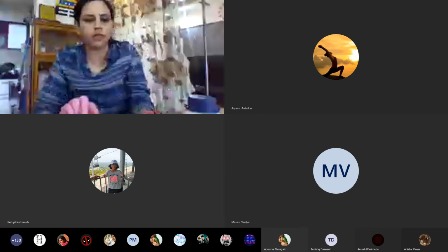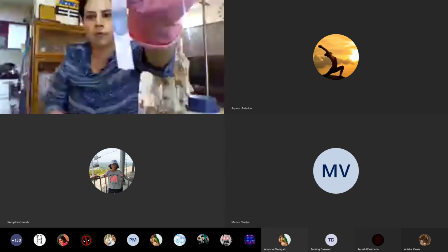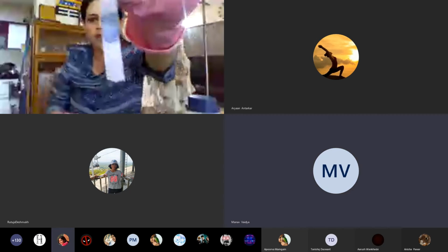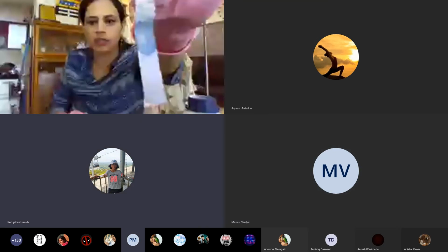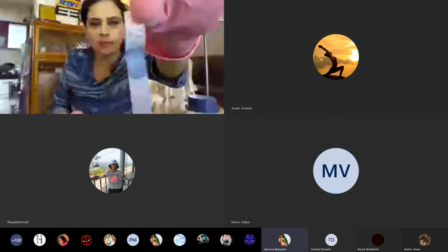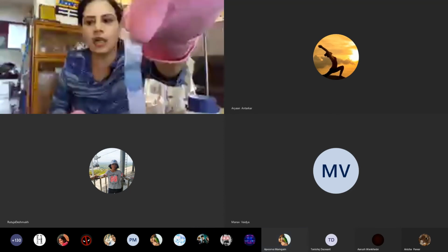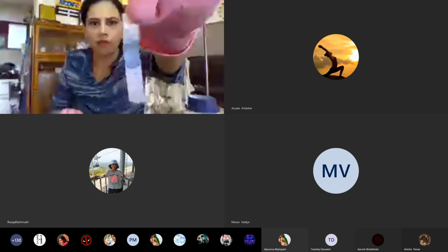Now you can see, children. Can you see the color change? The red litmus changed. Now why has it changed? Because the metal oxide is basic in nature. Understood?